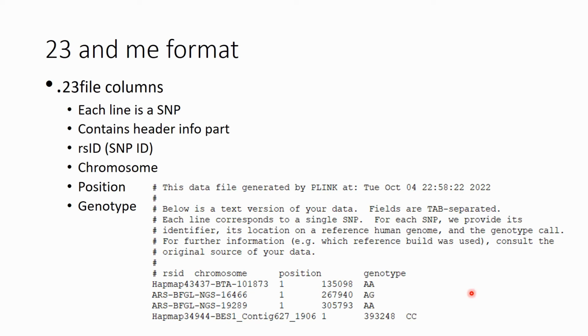Well, this was the last thing. I tried to look up all the possibilities for genotype data input in PLINK. I hope I didn't miss anything. If by chance something is missing, please let me know in the comments below.